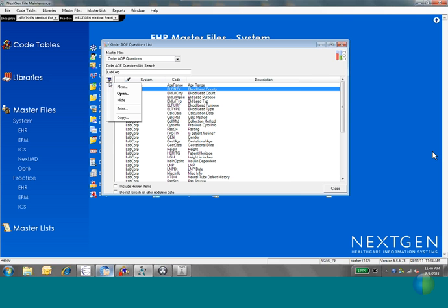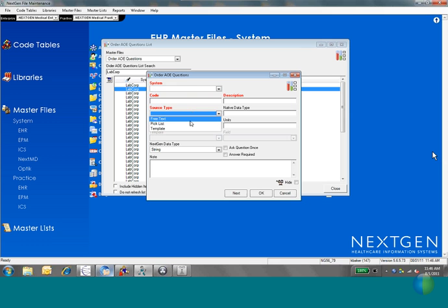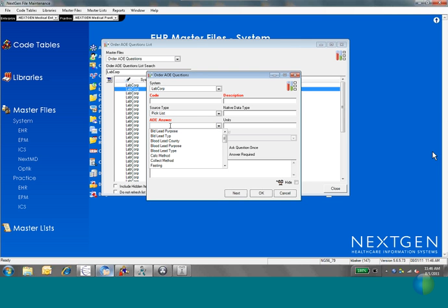And also notice if you do try to create a new one with a pick list, let me get this in here. AOE answer is required. So you can't fill this table out part of the way and then come back to it. It's a required field.